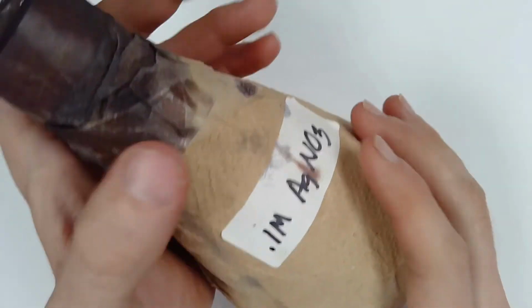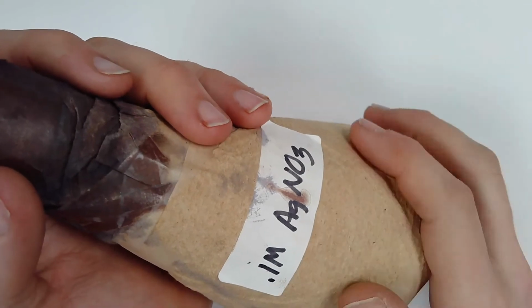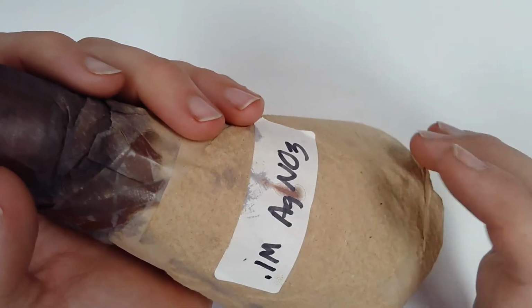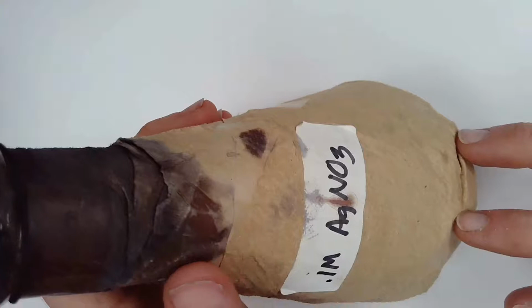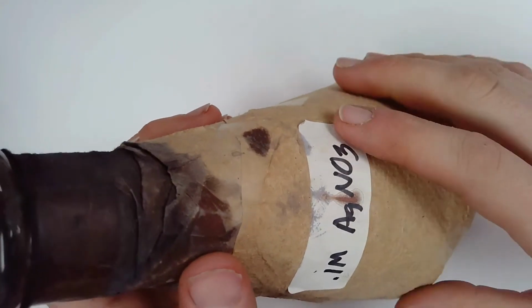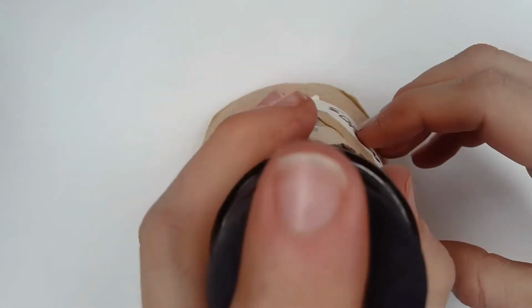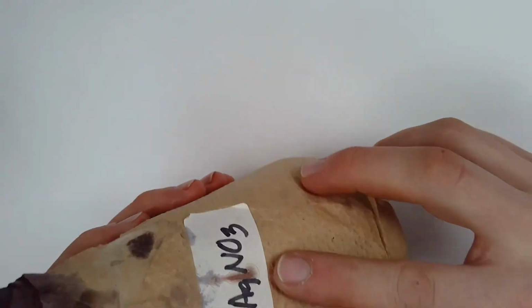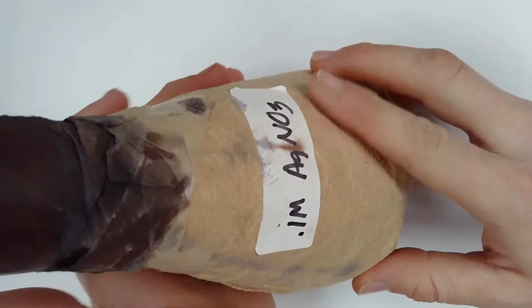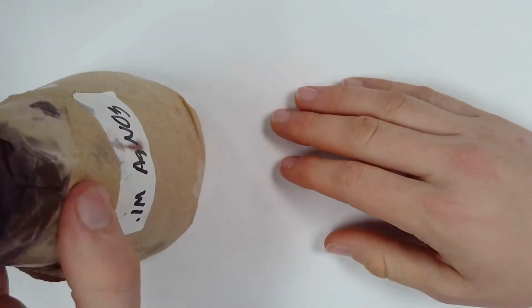This one also is like it. So knowing this was useful in photography, why do you think my silver nitrate is wrapped up like this? Right, so this is a light-sensitive chemical. And it's not like if I let the light in right now, oh no, all of the chemical's gone bad. Like, it takes time, but you have to protect it, especially because silver is a valuable metal. We don't want to mess up the solution. So you'll often find chemists storing it in something like this.